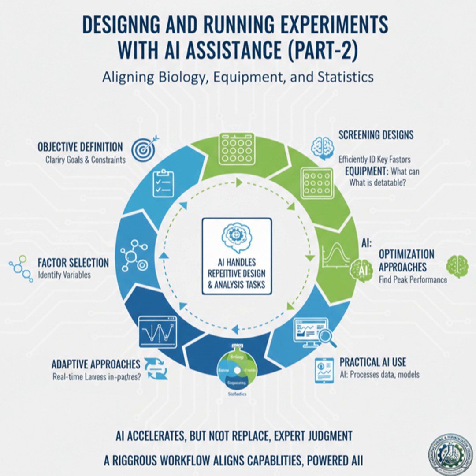Perfect analogy. Okay, so step 1 is defining a holistic objective. Step 2, then, is looking at the inputs, the factors. The variables, yeah. We're talking media components, feed rates, pH, temperature, dissolved oxygen, agitation, the usual suspects. The whole list. But there's a phrase in the notes here that just stopped me in my tracks. It says we need to set ranges that are biologically meaningful, not statistically cute.